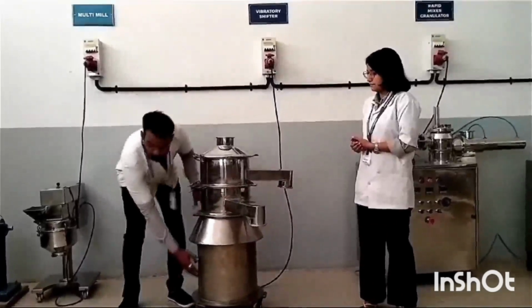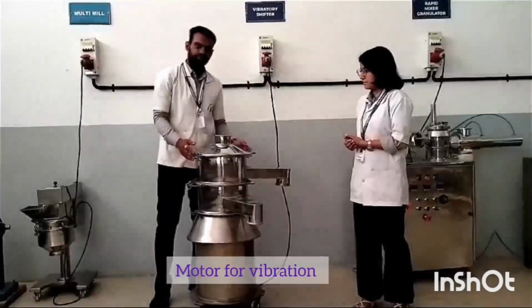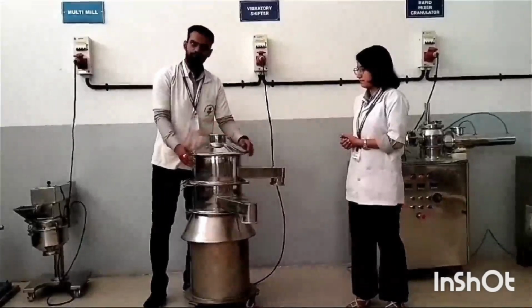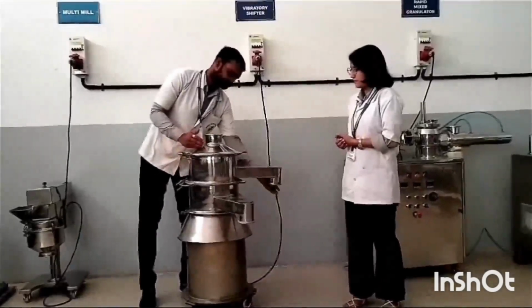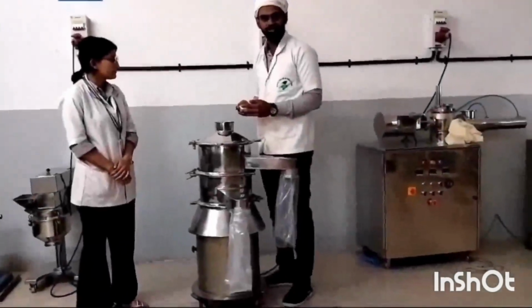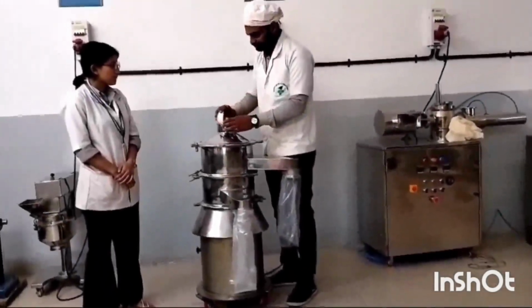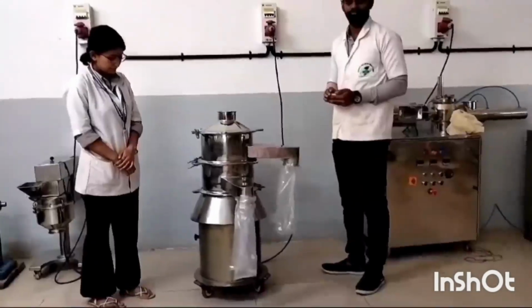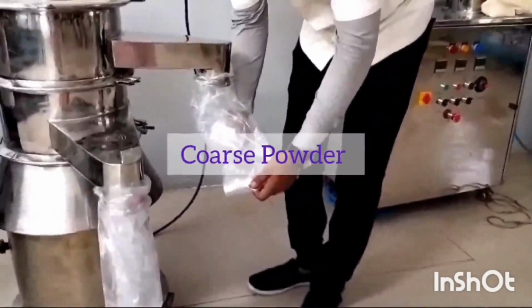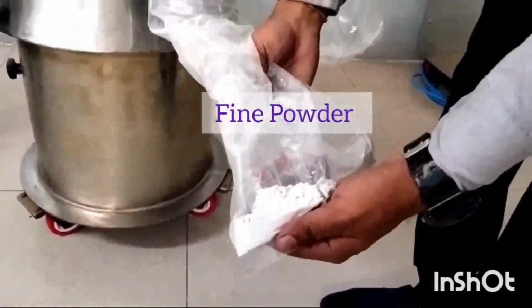At the bottom of the machine, it contains a motor which provides vibration to the machine, through which the material passes through the screens and the desired particles are obtained from the outlet. The first step, we are going to add the material inside the sifter. So, as you can see, in the first outlet there are coarse particles. In the second outlet there are fine particles.